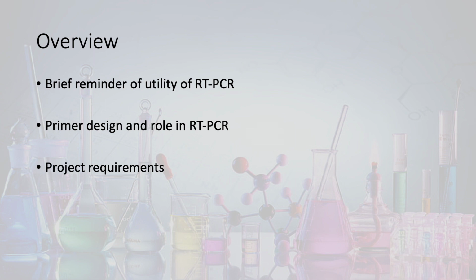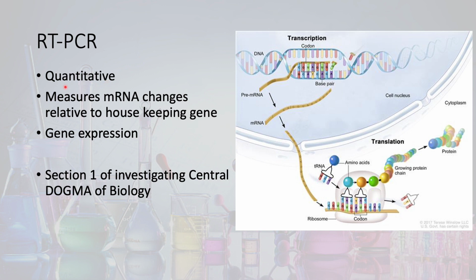And the goal of this week's lab is to design some primers to investigate the expression profiles of genes of interest. And similarly, I will highlight the key step they play in reverse transcriptase PCR. And then I will briefly touch on the project requirements, the things you need to accomplish for this week, as well as the assignments you need to upload.